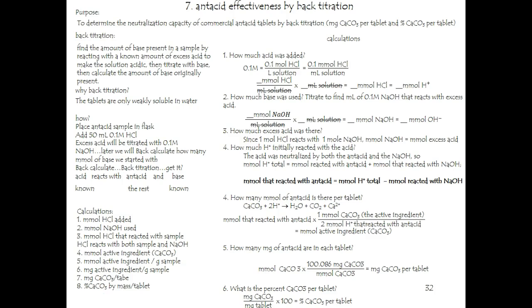So when we're doing the titrations, some brave group will be going first, and we'll watch what they do. And when they get to the point where it hits that yellow color with just a hint of green, let's all take a look at it, and we can match up to that color and use that as our titration endpoint. It's not as straightforward as a phenolphthalein titration. And so that's what we'll be doing.